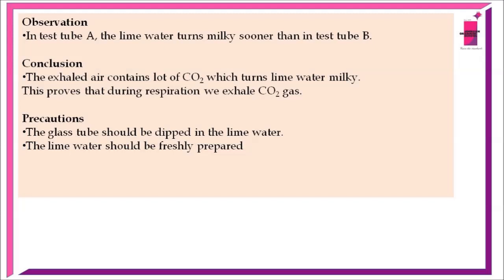Observation. In test tube A, the lime water turns milky sooner compared to the test tube B. Conclusion. The exhaled air contains a lot of carbon dioxide which turns lime water milky. This proves that during respiration we exhale carbon dioxide gas.